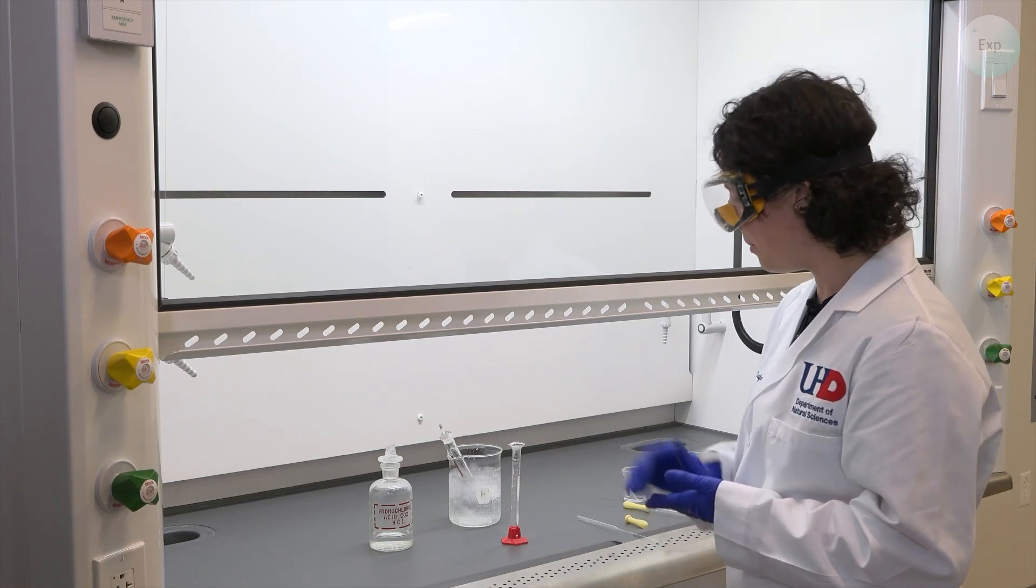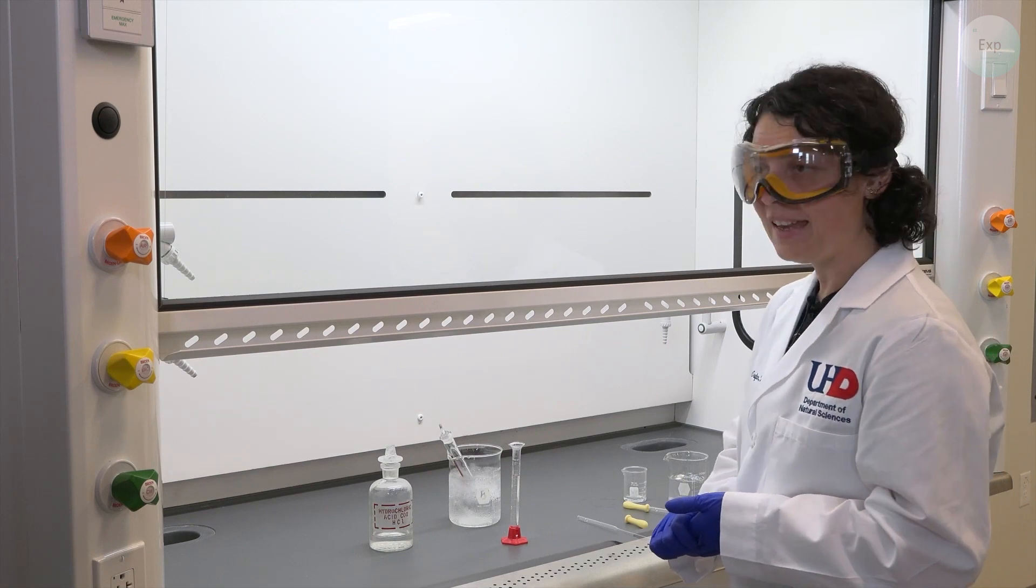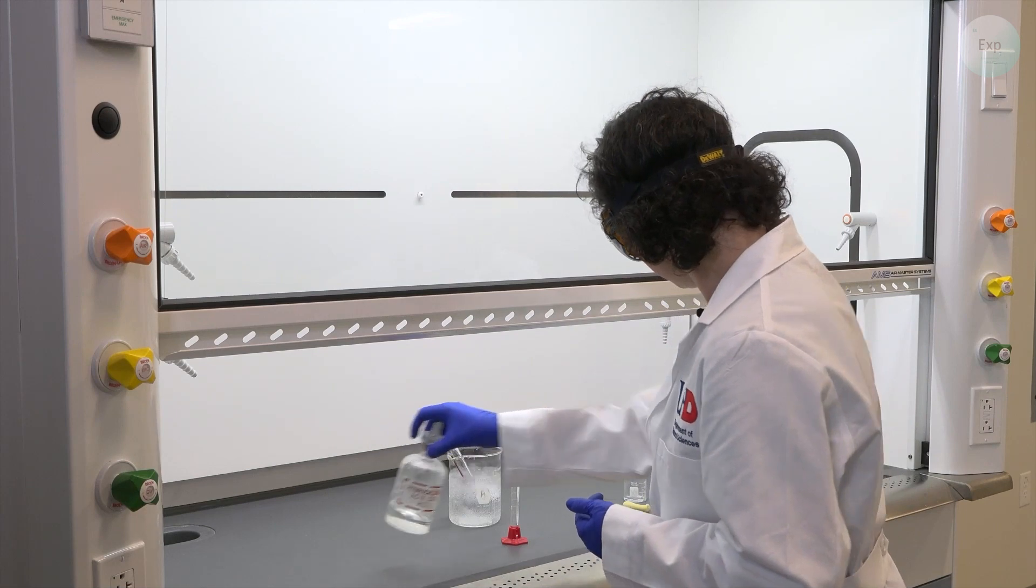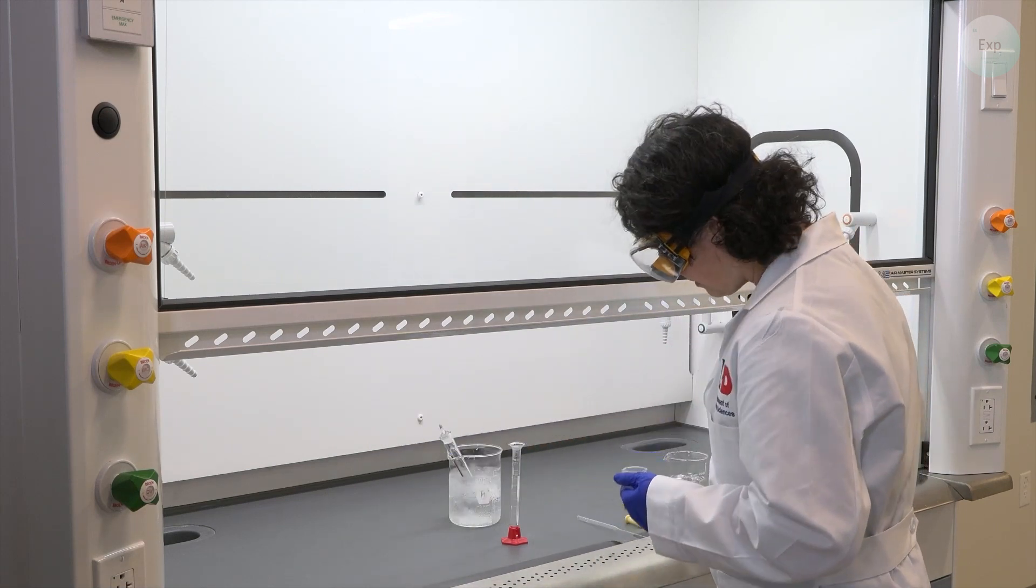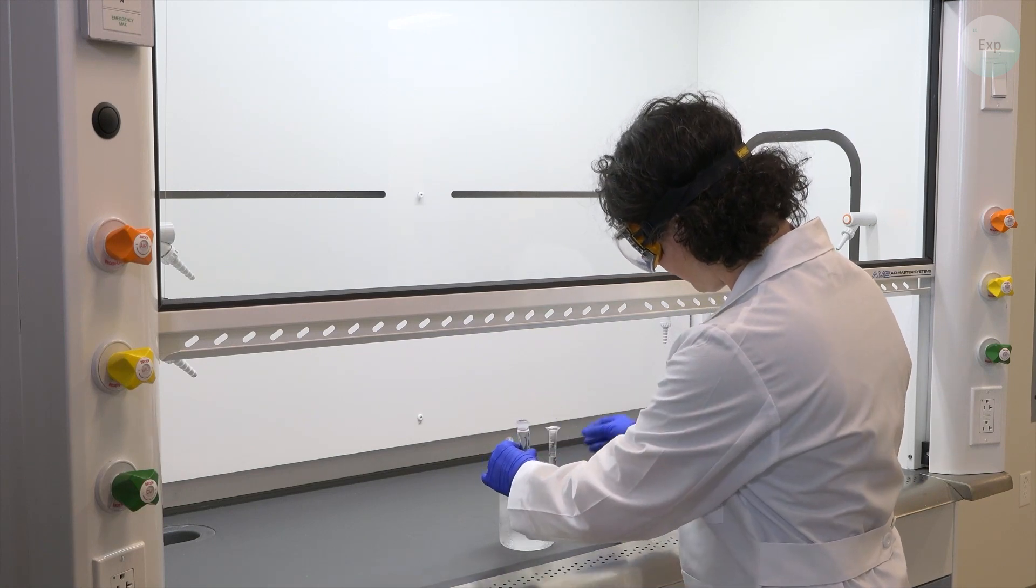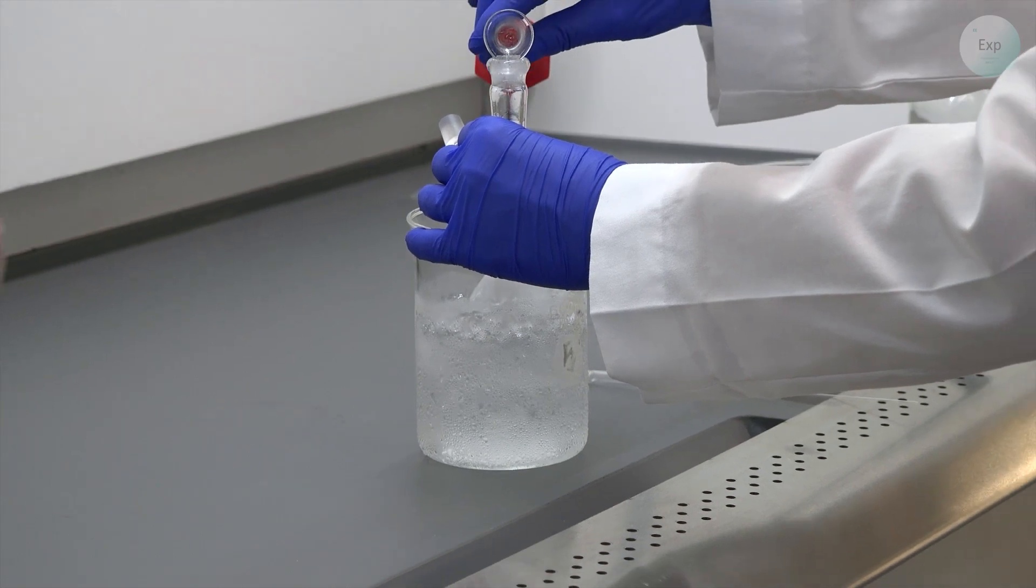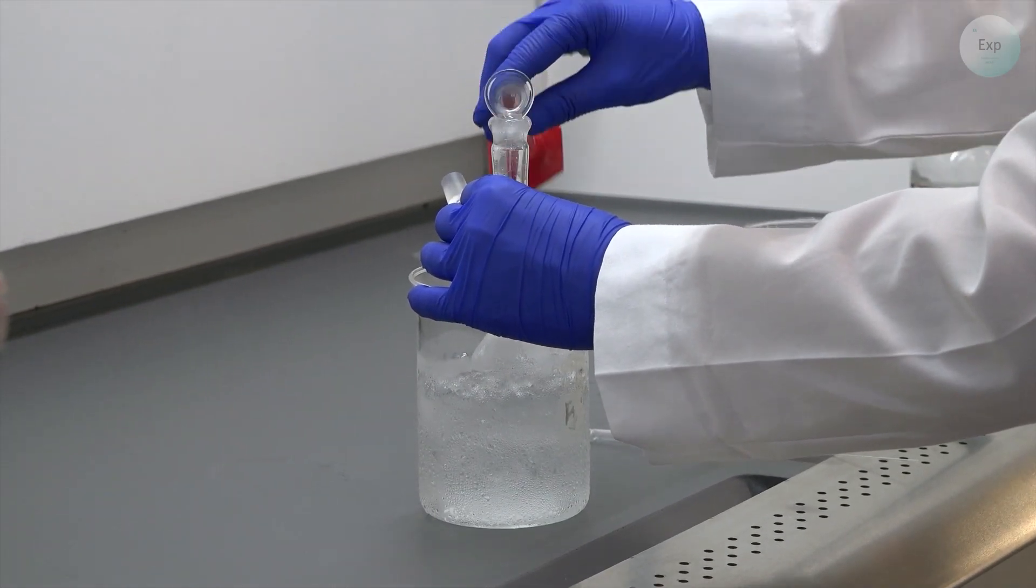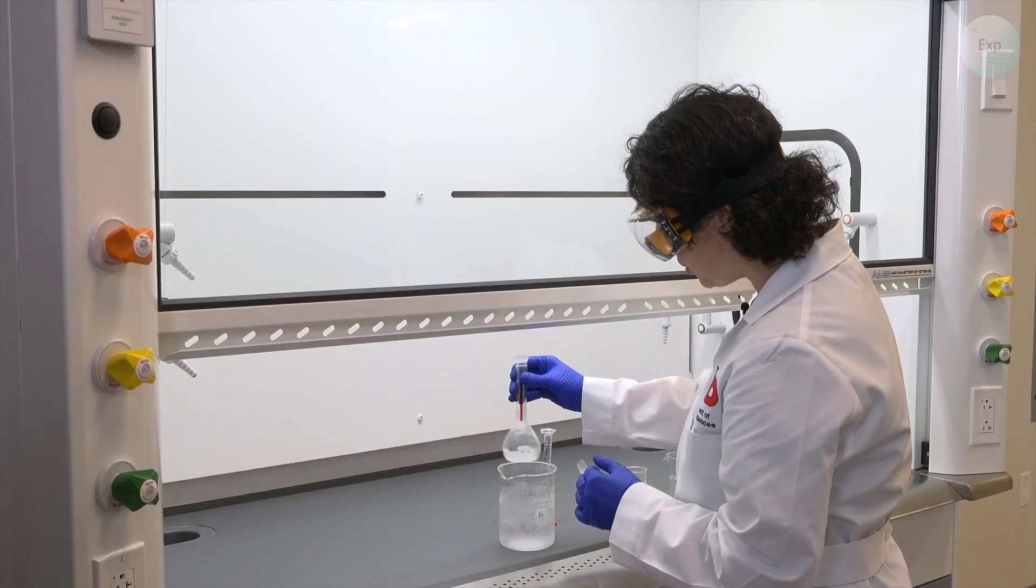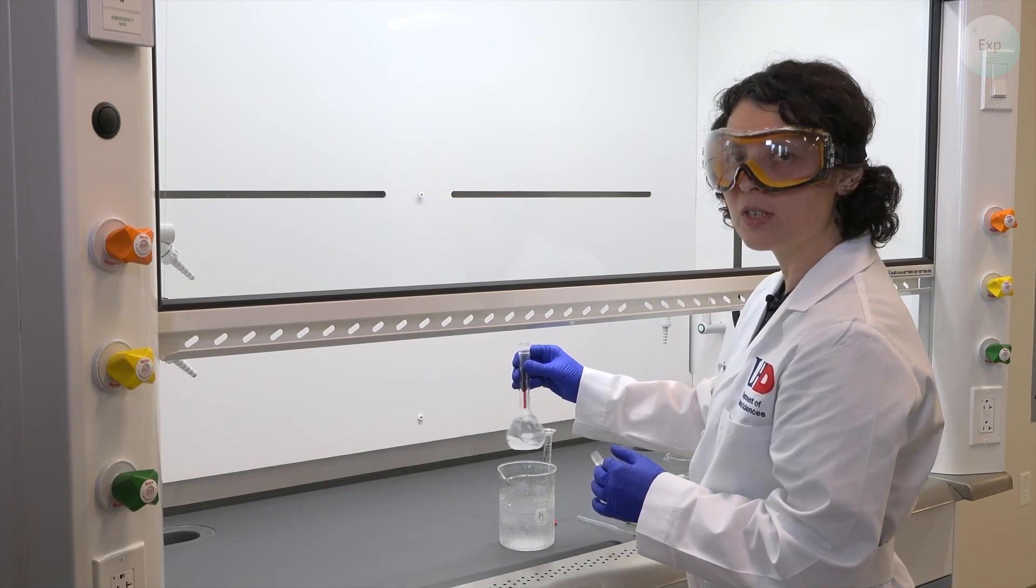I am done with measuring out 8.47 milliliters of concentrated hydrochloric acid. And now I can add it to my volumetric flask that has the water in it. The addition should be done in small increments. And every addition should be followed by some vigorous swirling to make sure that the solution is homogeneous.